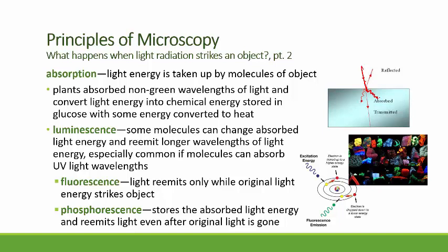The explanation for how this kind of luminescence occurs is a little bit complex. But here we see the light energy coming into a molecule, in this case to an atom in the molecule. An electron, shown here as this yellow electron, gets bumped up to a higher energy state. That electron absorbs this energy and is still circling around the same nucleus.